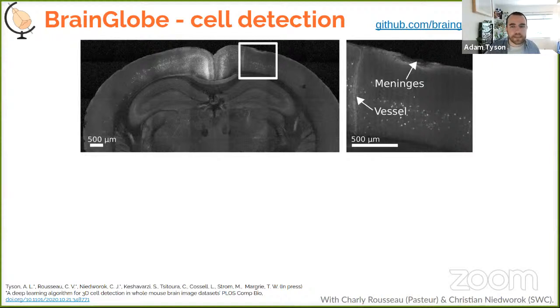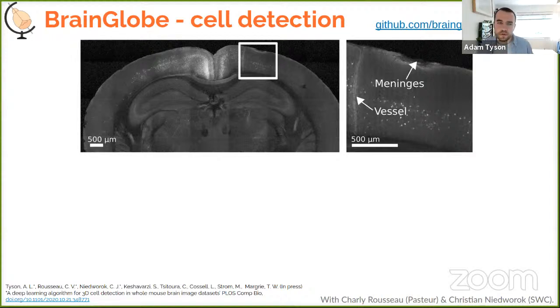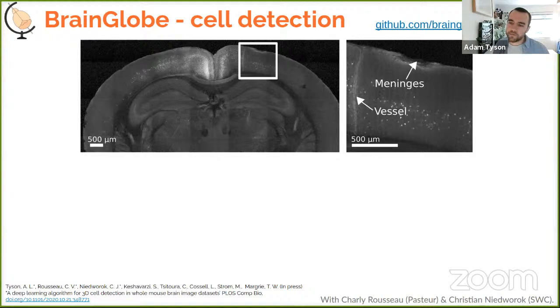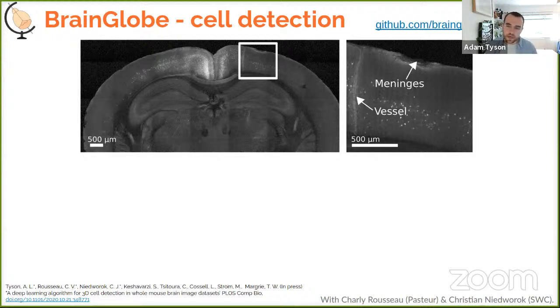Classical image processing techniques like spatial filters and intensity thresholds — the kind used in Fiji, ImageJ, and CellProfiler — work well in some areas, but these brains have lots of artifacts where signal to noise varies greatly. Blood vessels have high autofluorescence, meninges remain on the brain surface, and there can be tissue damage. It's very difficult to find a classical method that picks up every cell without also picking up lots of artifacts.